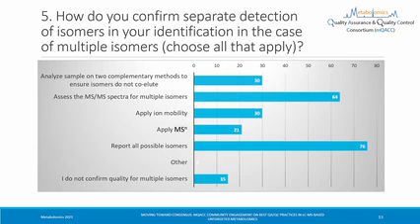Isoleucine and leucine have very limited MSMS mass spectra, so separating those based on the MSMS spectra is difficult. Ion mobility, it was great to see within there, and actually quite a traditional approach is to use two different chromatography assays and look to separate out isomers using that. So they might co-elute, for example, in one assay, but in the other assay you'll see separation of those.